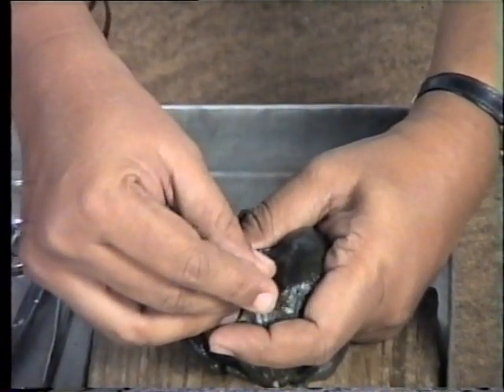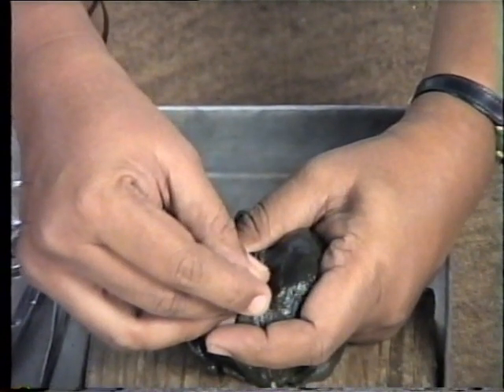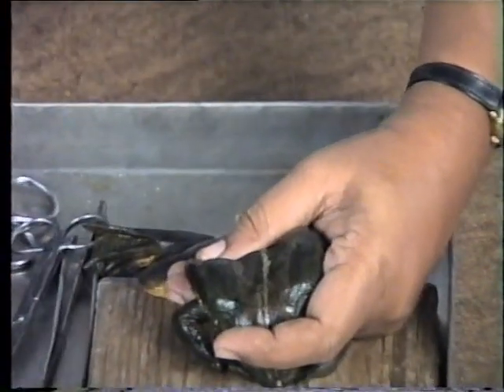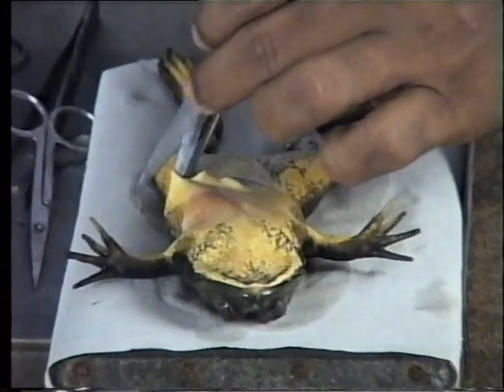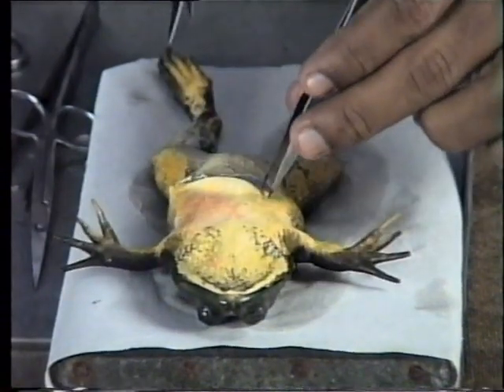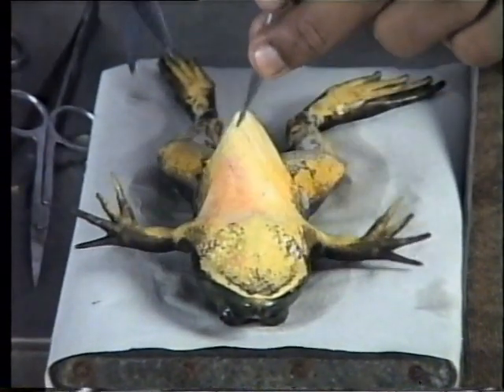Now the animal is alive but the brain and the spinal cord are destroyed. It is now ready for dissection. Place the pithed frog on the dissection board and make a transverse incision in the skin, then a median incision.